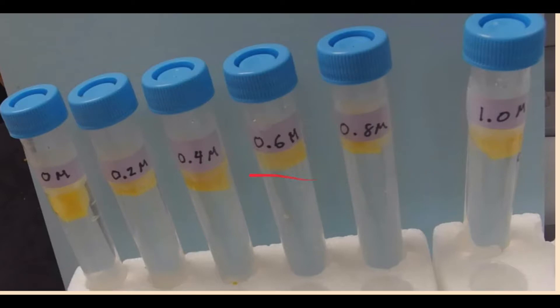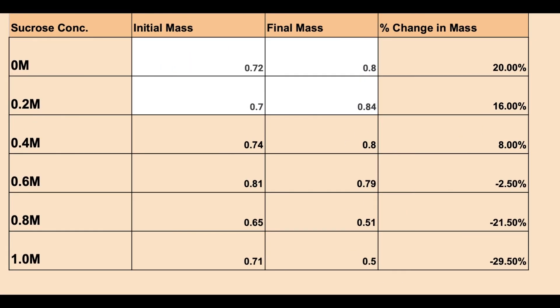So we're going to set it up just like this. We have 0 molar, 0.2, 0.4, 0.6, 0.8, and 1.0 molar sucrose. That's the surrounding solution. And we're taking our equal-sized pieces of the pumpkin core and putting them in the tubes. Wait overnight, get the mass right now before we put it in, get it after it sat overnight, and behold, we have a percent change in mass.